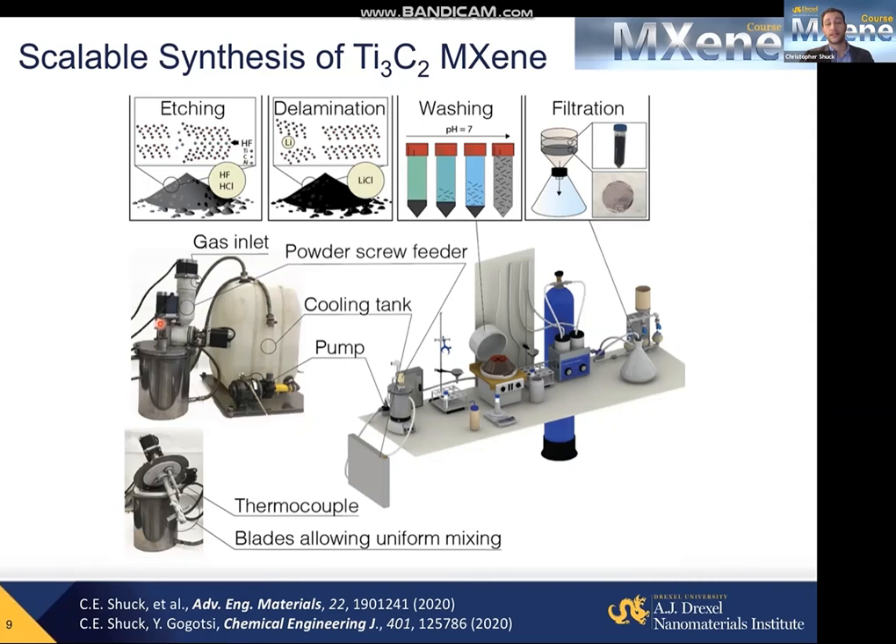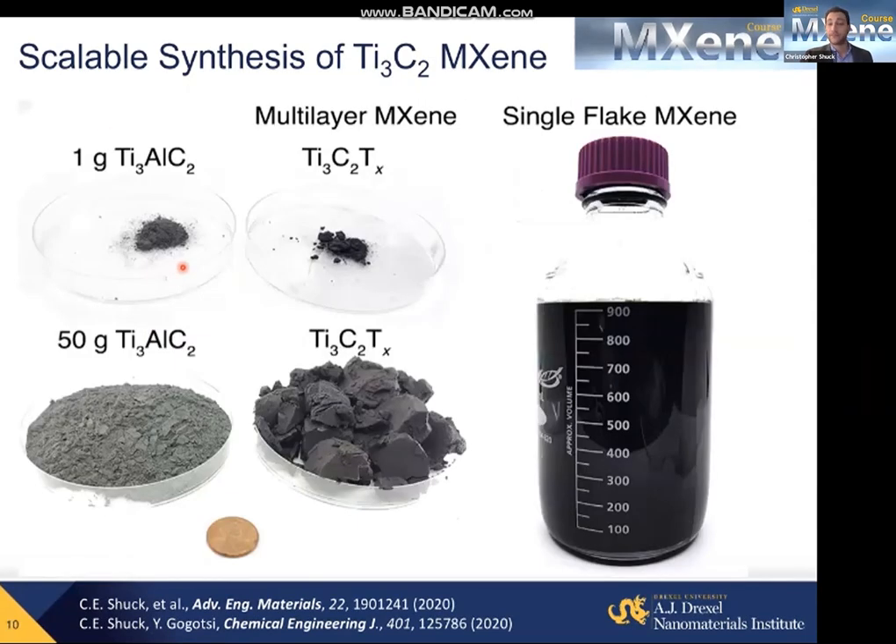What I'm showing you here is the reactor we have in our lab that allows us to produce up to 100 grams of MXene at the same time. And this is what 100 grams of MXene looks like.